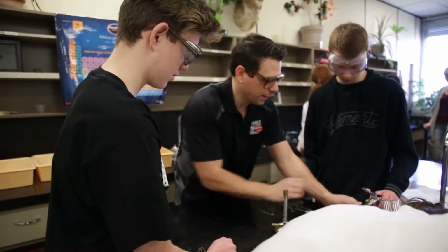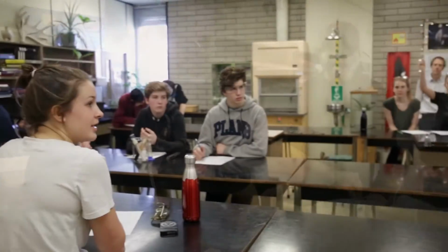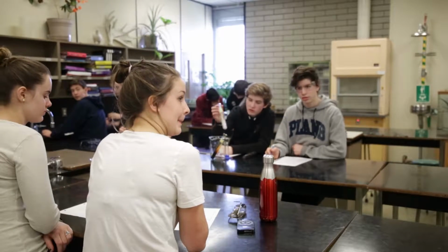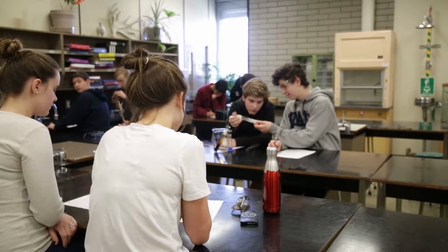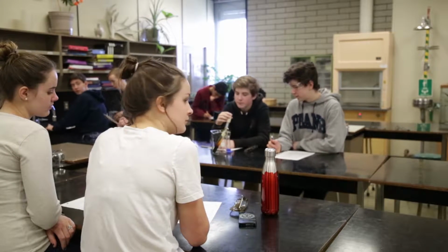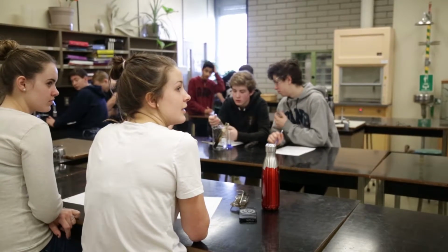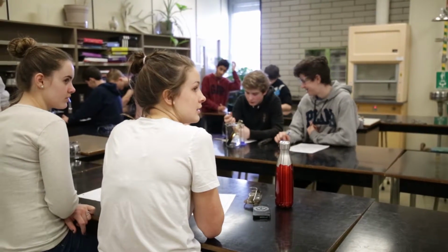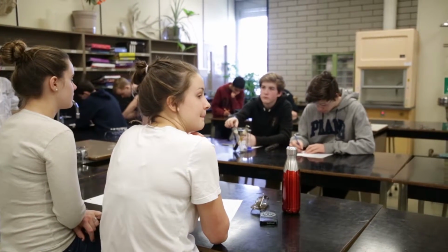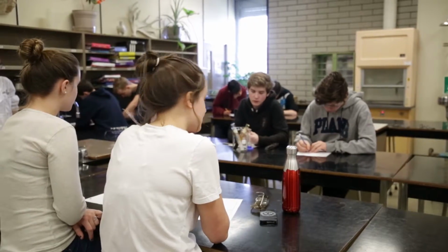We get a different burner, maybe this one's plugged. First one, but that's after I did the experiment. Okay, so that was after quadrant number 3, the observation. Right? I noticed on your page that you had drawn a picture in your predict quadrant. What did you have coming out of the test tube top? Steam. Yes. Okay, so you predicted that a solution would go from liquid to a gas, so we had a change of state as a prediction.